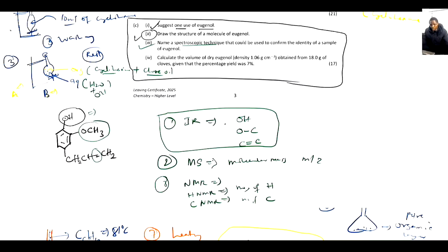And maybe you also want to check the concentration, the absorbance level. UV is very rare to use. UV and maybe HPLC. This actually helps you to calculate the concentration. So it's majorly for concentration. HPLC might not necessarily be used.